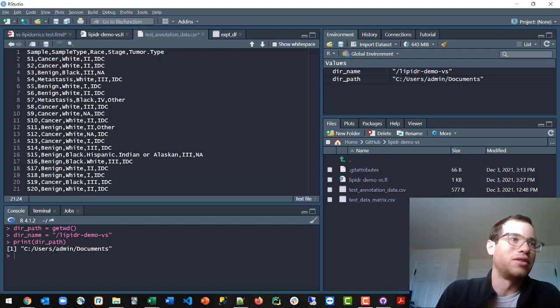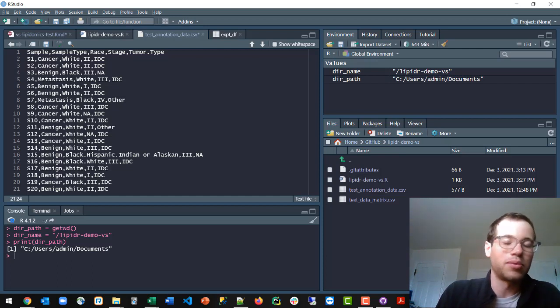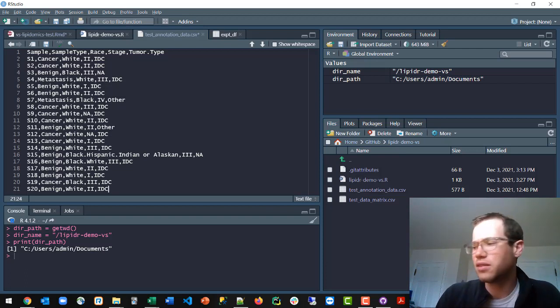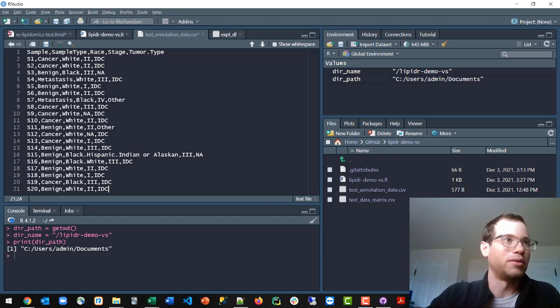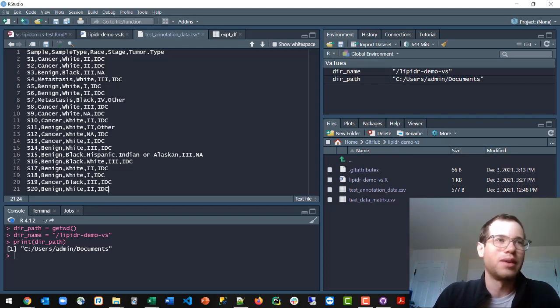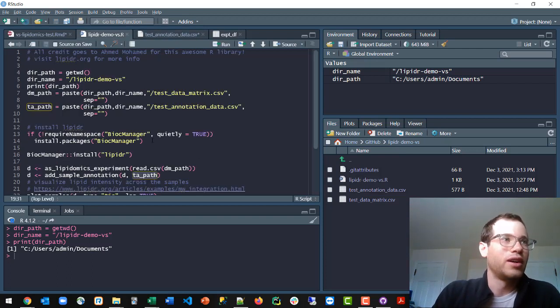That will correspond to the actual column names that it has. And so that's where you're going to define and tell lipidr which of the samples within your study were the control versus the actual experimental mice where you knocked out a gene or you fed them a different diet or whatever. So that's what you're doing there.